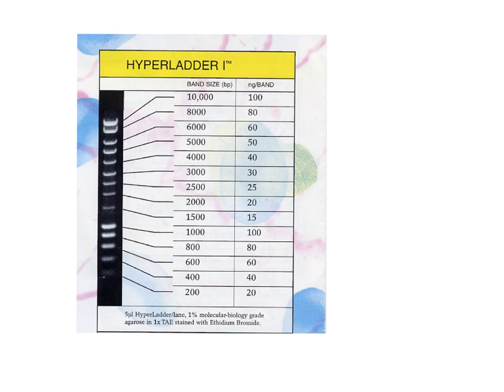But first we'll have a look at the molecular weight standard that we ran on the gel. Now these are DNA fragments of known molecular weight and we can see it's a commercially available one called Hyperladder 1, and there are DNA fragments from 10,000 base pairs to 200 base pairs.